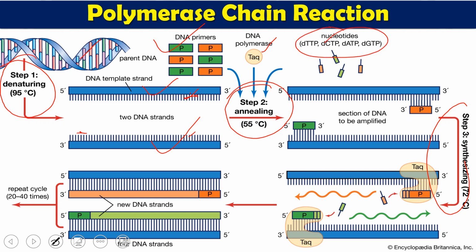By using deoxyribonucleotides in the presence of this enzyme, Taq thermostable DNA polymerase, the first primer will bind there, and then the DNA polymerase extends the primer using these nucleotides in the specific reaction mixture, or you can call it a microenvironment, where pH is maintained and divalent metal ions are present. So ultimately from these strands we get two double-stranded DNAs, and these go for the next cycle. The next cycle means denaturation, annealing, and elongation again. So this process goes on.